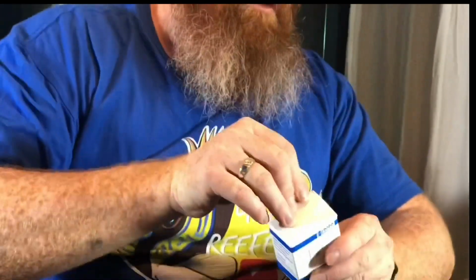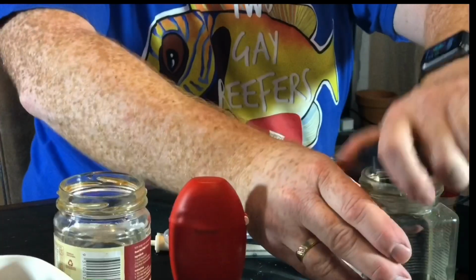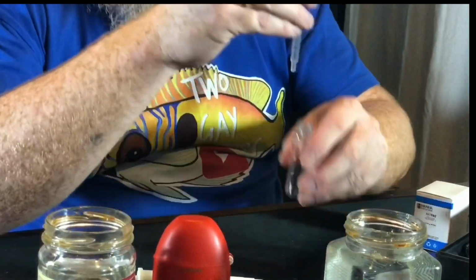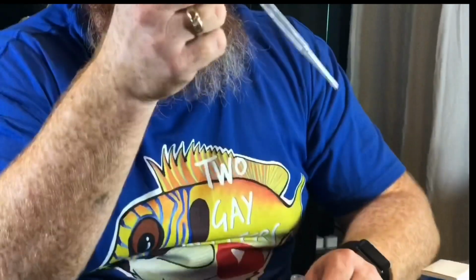Next one, have you ever done a calcium test with the Hanna Checker? It's a pain in the ass. That's why you gotta have RO water ready. Alrighty, you've got your checker itself, you've got your reagent, you have your little satchels of reagents as well. Don't get it mixed up with your phosphate one, because that'd be bad. And then you've got all these bits and pieces here that you need. First thing you want to do is get your calcium reagent, your 1 mil syringe, and put that into the vial.